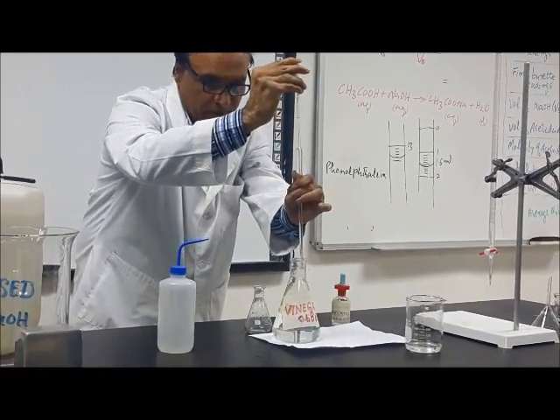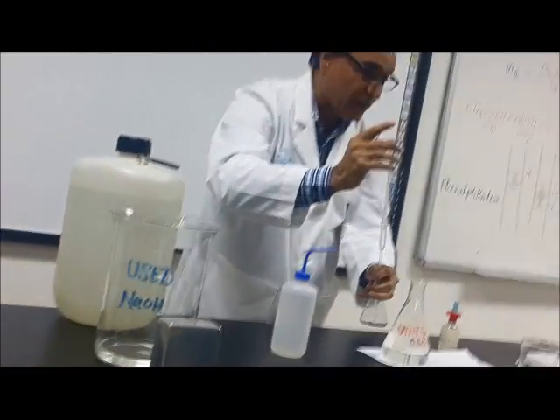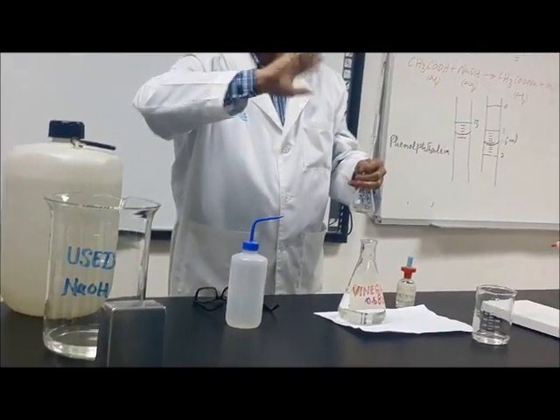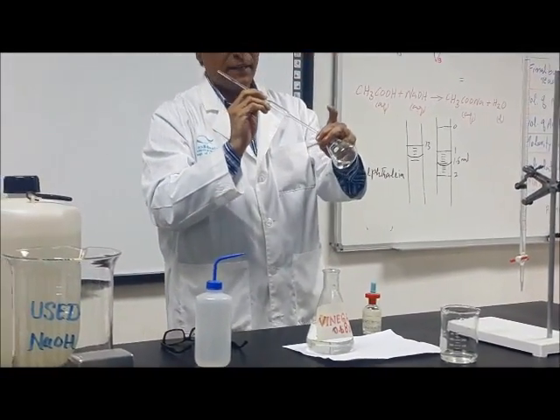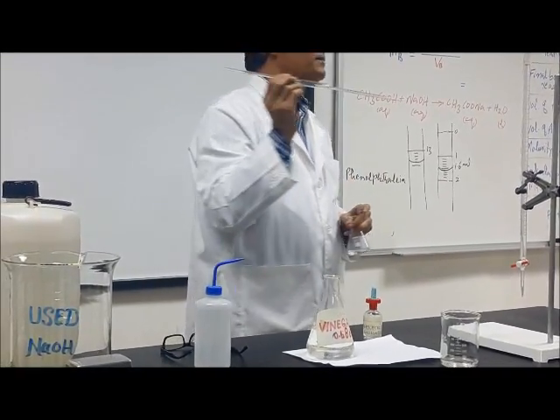Like that, and like this. Because I have experience, so I did it in one time. If you do it many times, nothing to worry. Don't blow it, let it go by itself, and when it is empty, 1, 2. And there will be a drop. Don't worry about the drop.